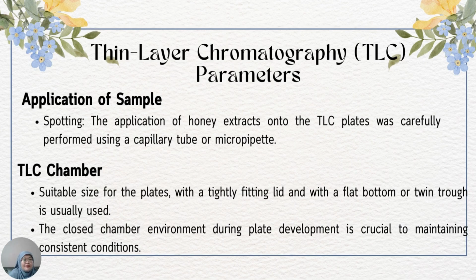For the application of samples, we use spotting, and it should be carefully performed using a capillary tube or micropipette. So this ensures precision in spotting and helps in obtaining clear and distinct spots.